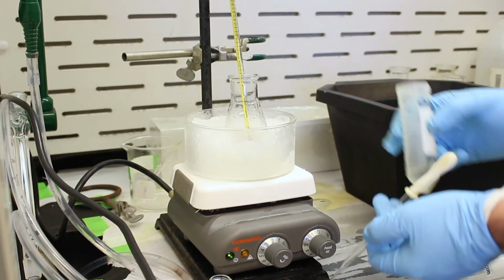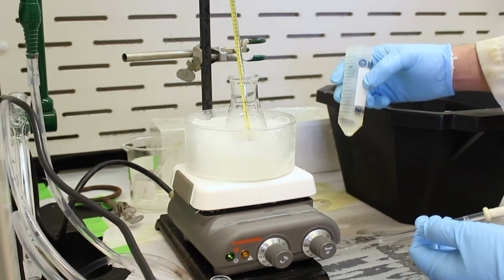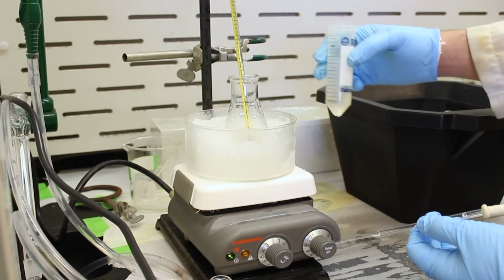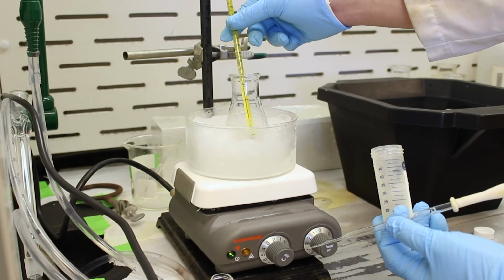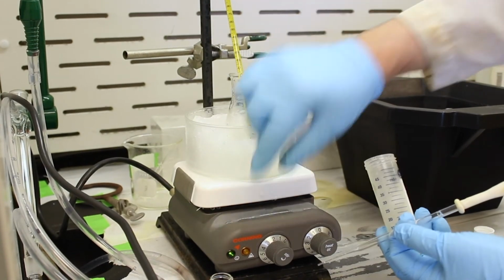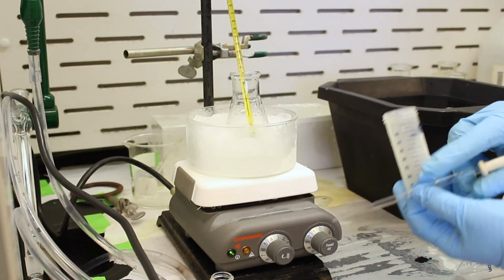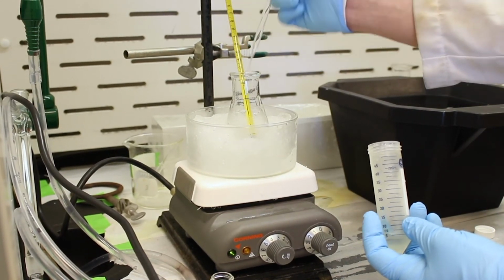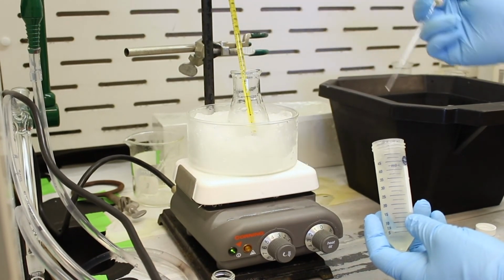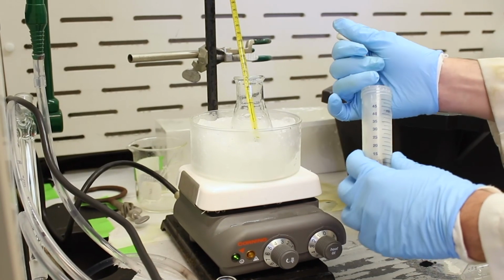The way that works is we're going to add the nitration mixture. So this is the electrophile. Our nitronium is in here. And we're going to add it dropwise as quickly as possible, but at the same time keeping it below 15 C. So we're going to increase the stirring a little bit, and we're going to begin addition. If the temperature doesn't exceed 15, I'll add more. But if it starts to exceed 15, I'll stop adding. So here we go.